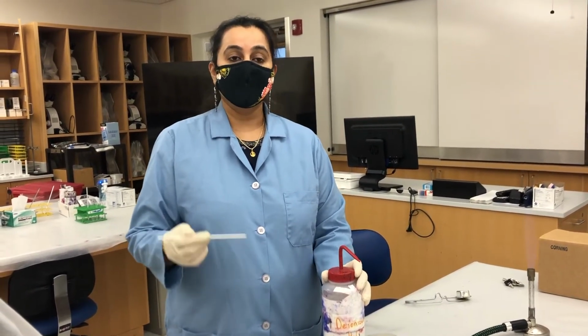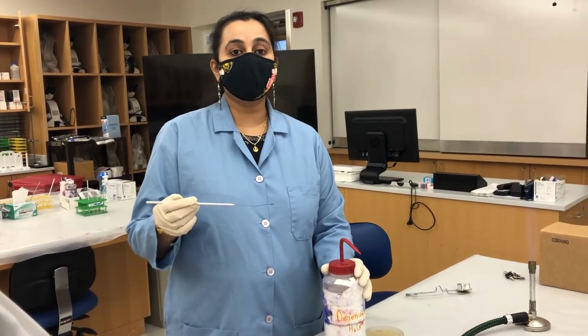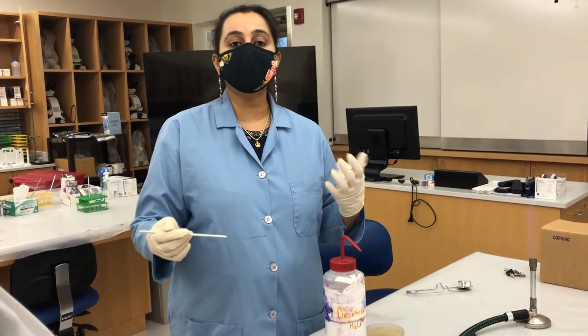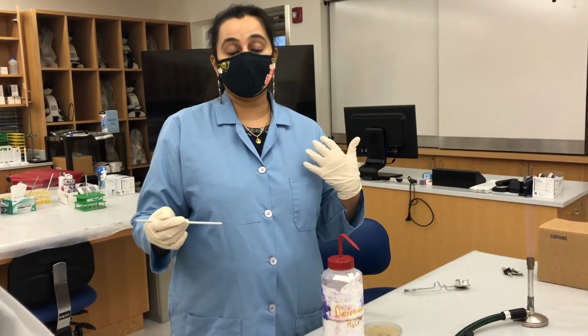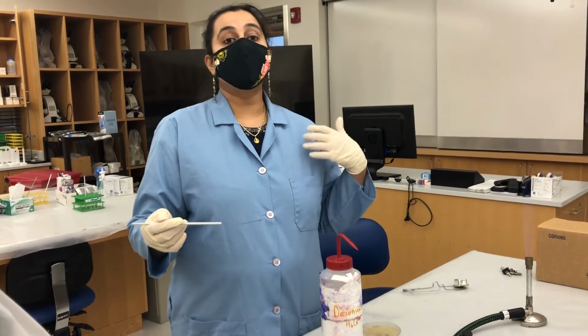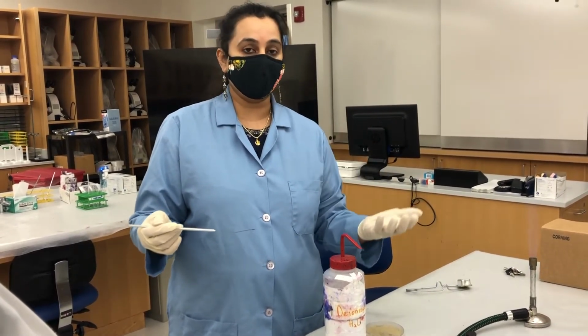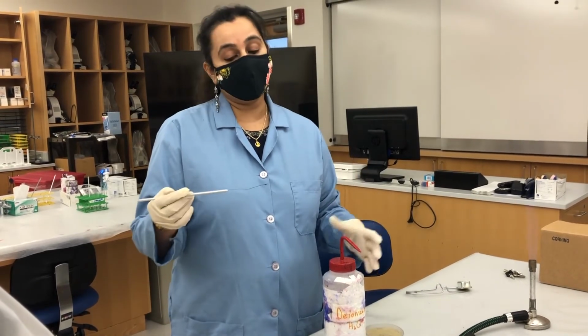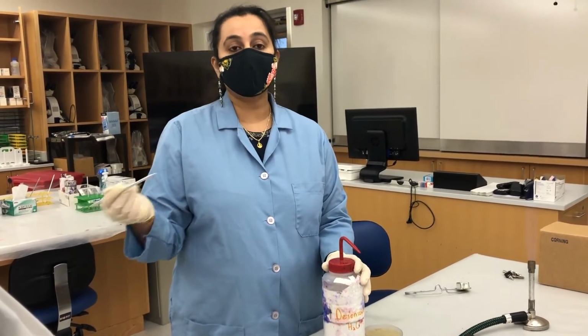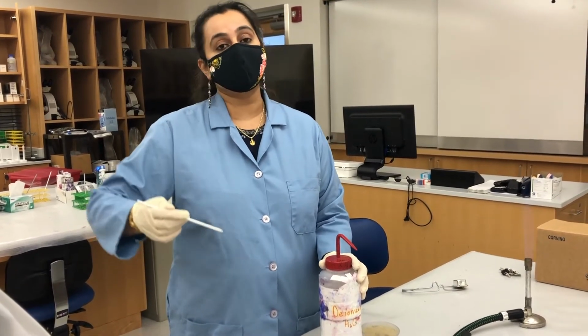Think about a patient coming to a physician's office with an infection. The most important thing is the physician has to find out whether the infection is from gram negative bacteria or from gram-positive bacteria. Only then the right antibiotic can be given to the patient. So the very first technique would be, once the microbiologist would streak the plate, the next technique would be the gram staining technique.